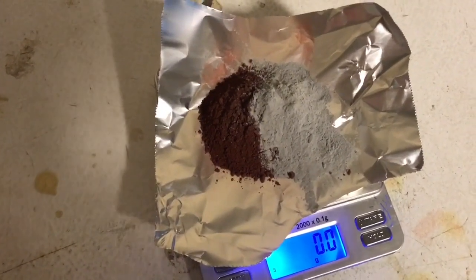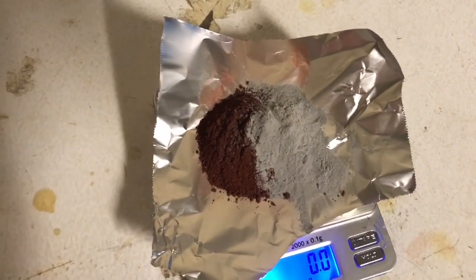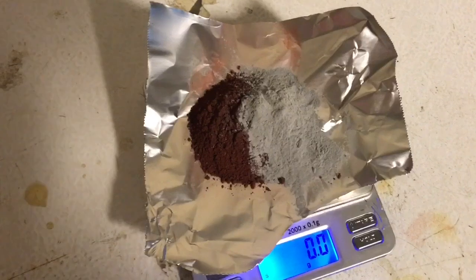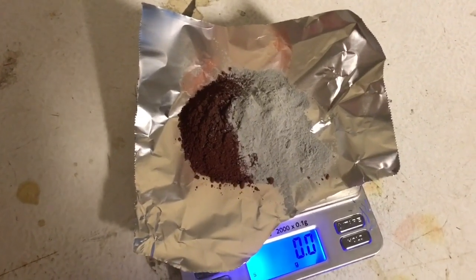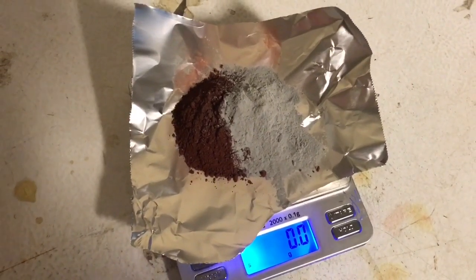I'm going to mix this up, and then we're going to light it with a strip of magnesium ribbon. Just when it's finished burning and you've got a pool of hot molten iron, I'm going to quench that with liquid nitrogen, and then we're going to see just how magnetic the iron product is.